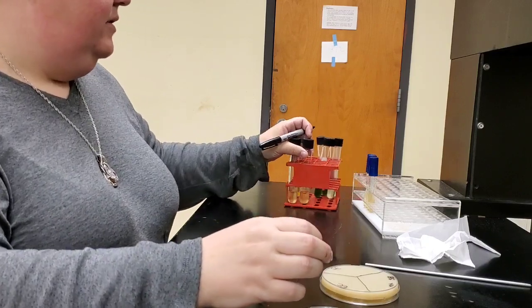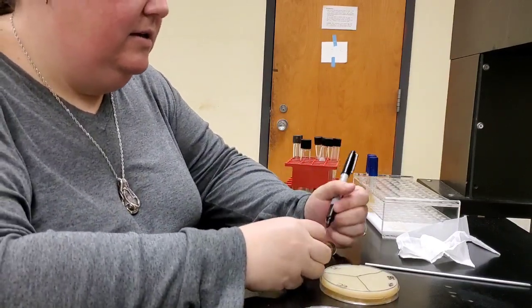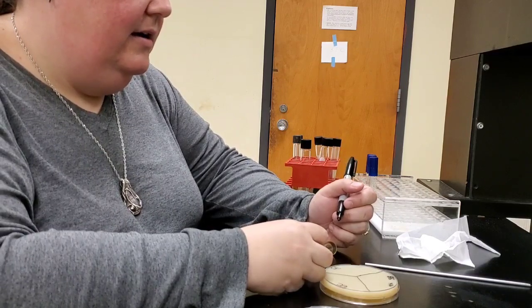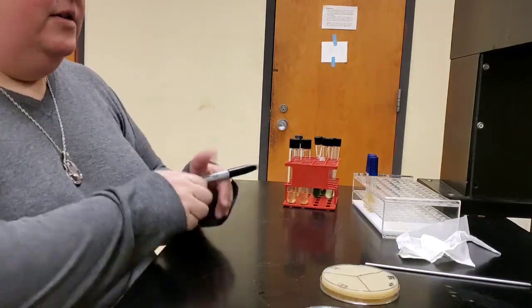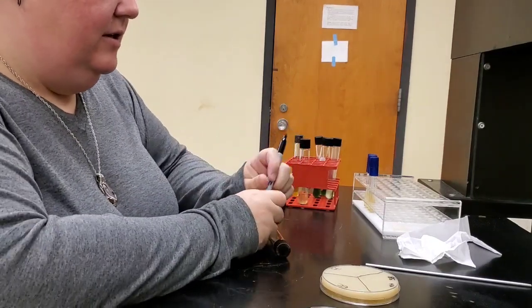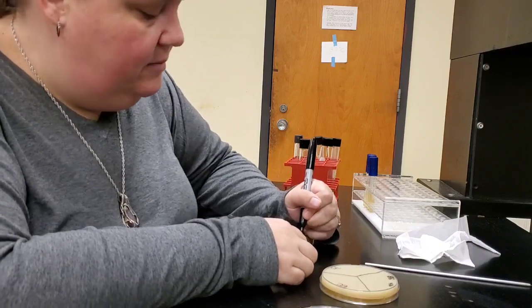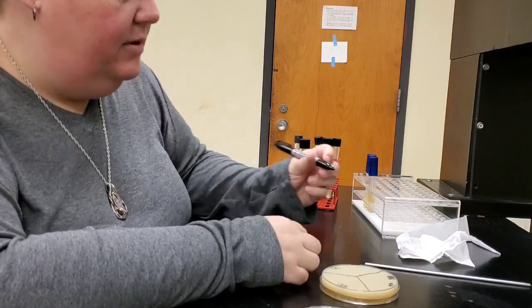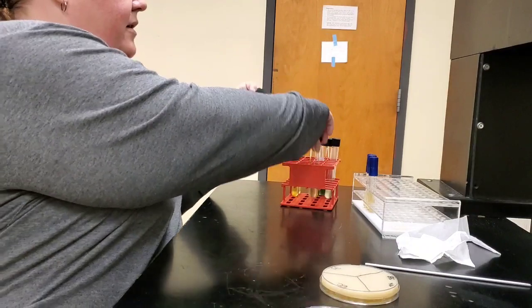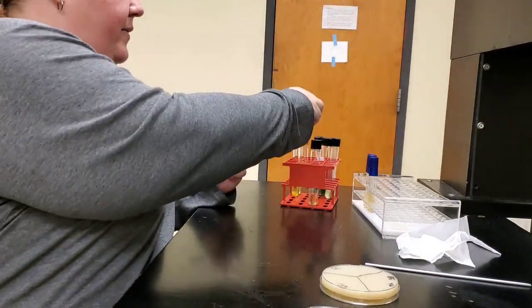And we're also going to test for gelatinase production. We test for gelatinase production in a tube of nutrient gelatin. We're only going to test 2 microorganisms, Bacillus subtilis in one tube, and Escherichia coli in the other tube.